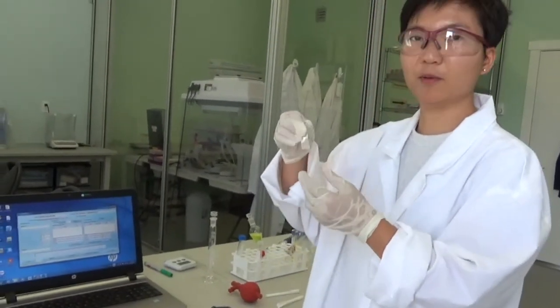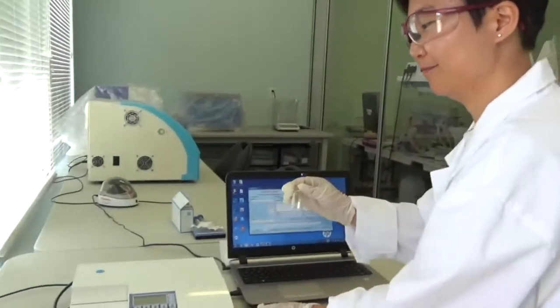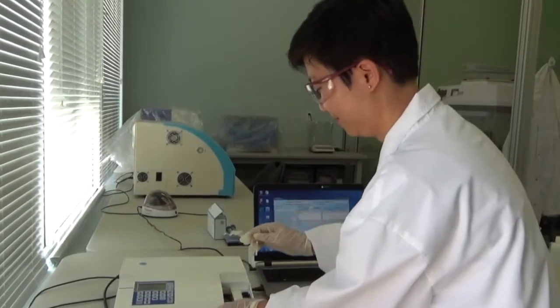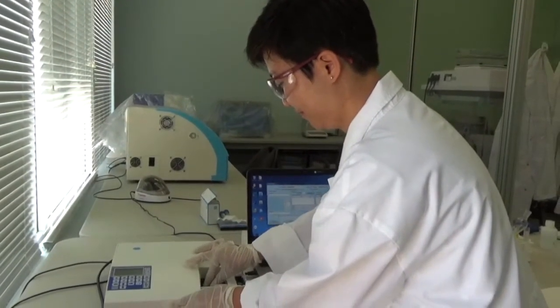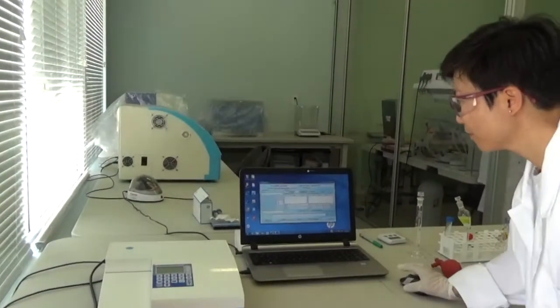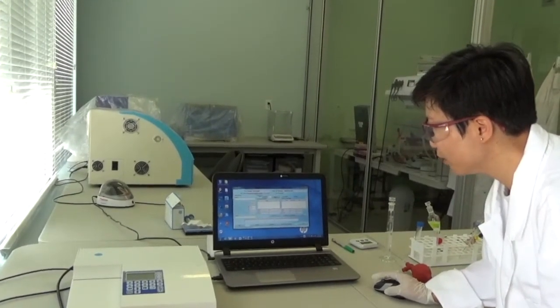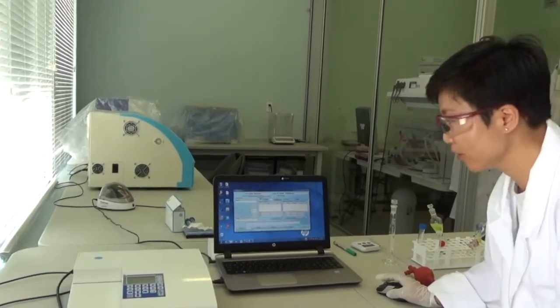So the cuvette has been filled up and we can place it into the analyzer. So we're going to measure the amount of anionic surfactant in the extracted solution.